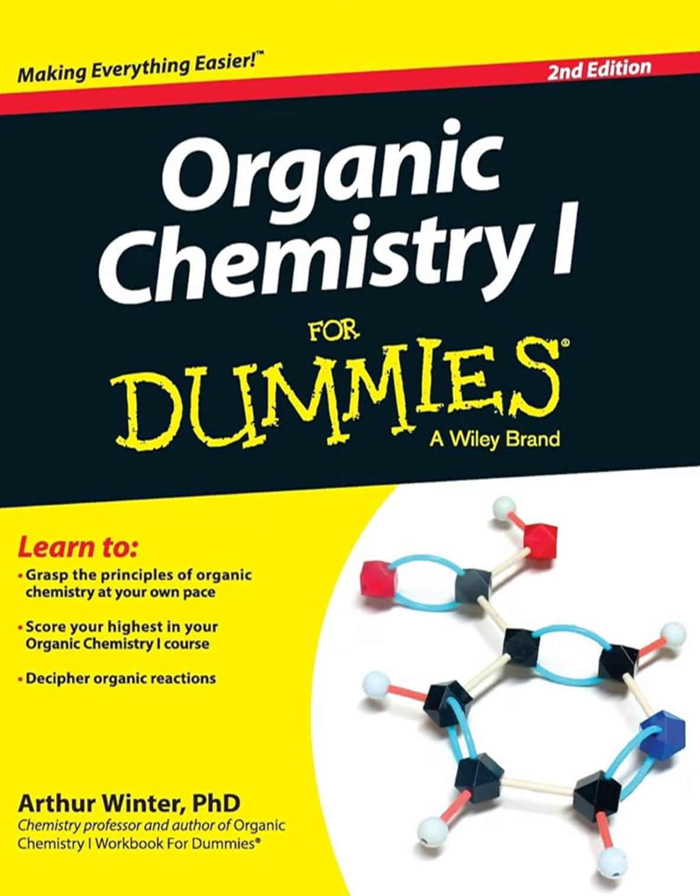Okay, that whole process, those 6 clues, seems really systematic. Theory is one thing, but maybe we could run through an example. Absolutely. Application is key. Let's try one from the sources. Okay. First case. We're given the molecular formula C8H8O2 and its 1H NMR spectrum. No IR this time. C8H8O2.